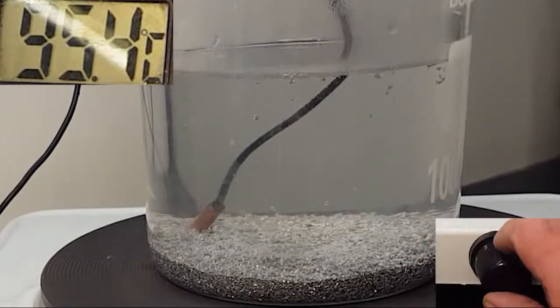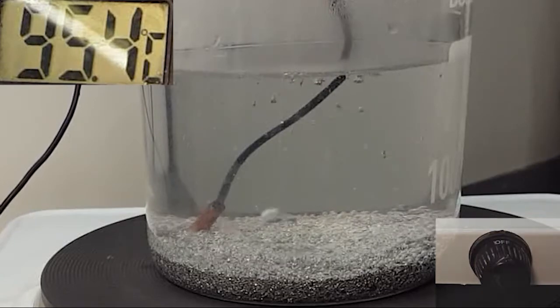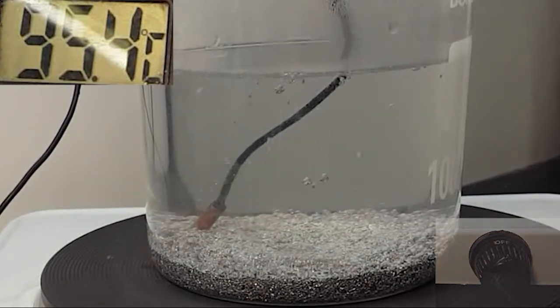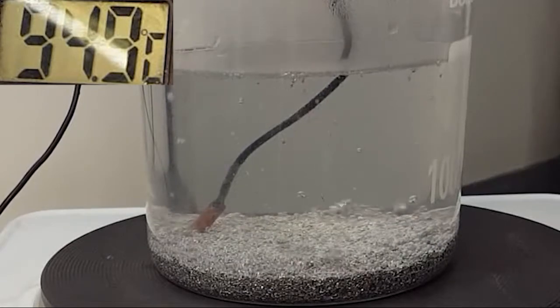I'm going to turn the temperature down now. This reaction is exothermic so after a little while you don't need to add any extra heat. In fact it's getting a little hotter than is really perfect right now.